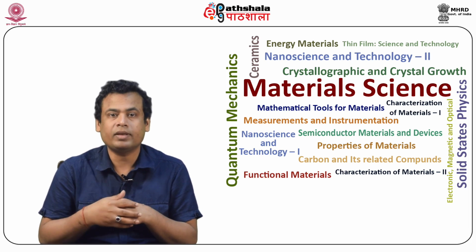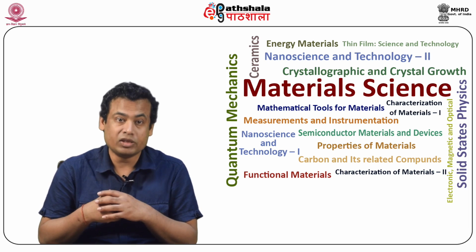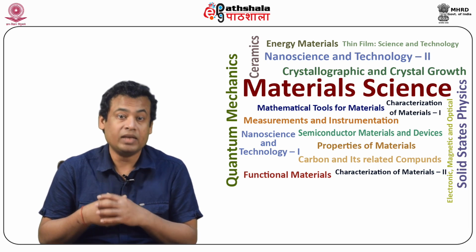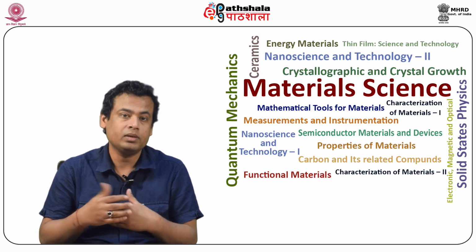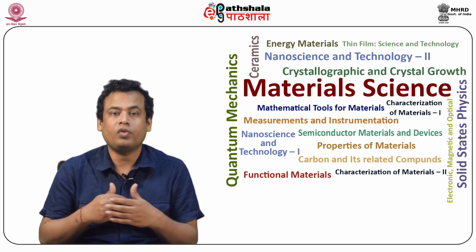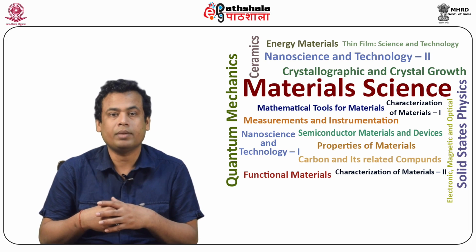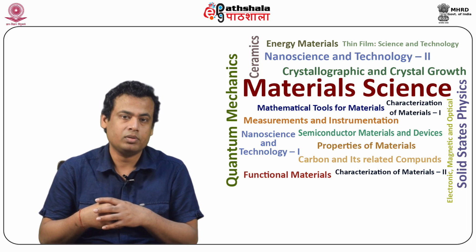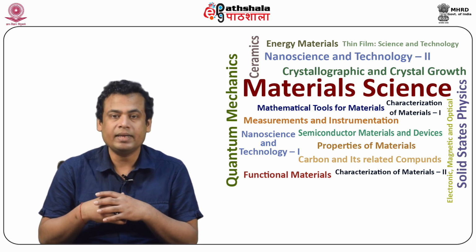Each scattering event might occur as an elastic or inelastic interaction. Hence, the total interaction cross section sigma t is the sum of all elastic and inelastic terms, which can be estimated as sigma t equal to sigma elastic plus sigma inelastic.